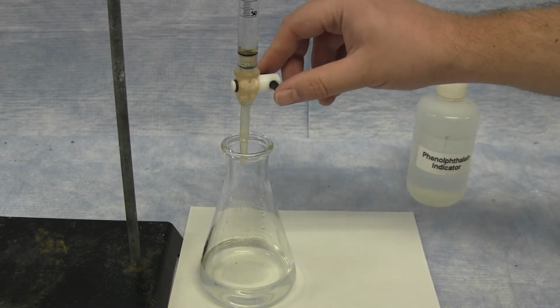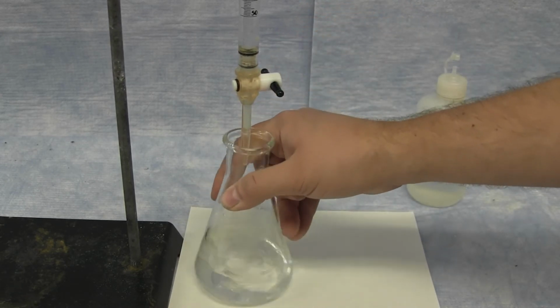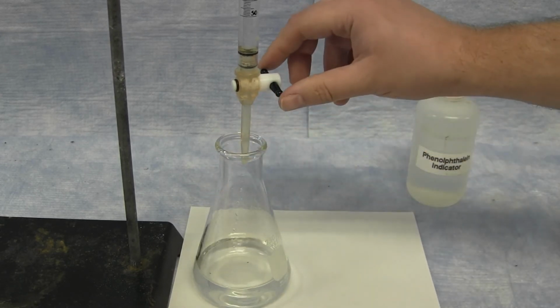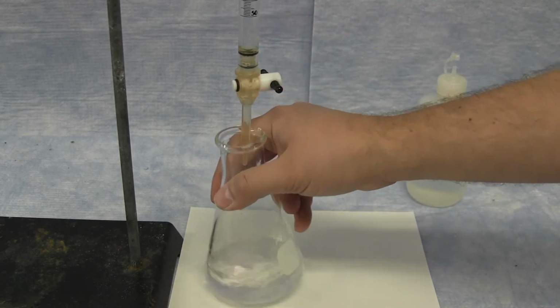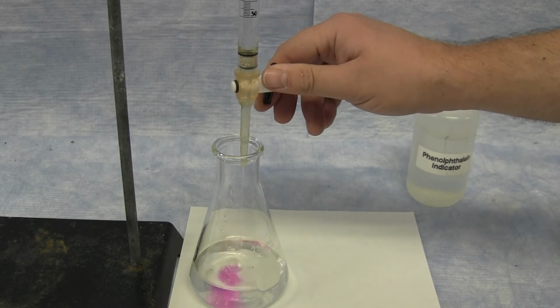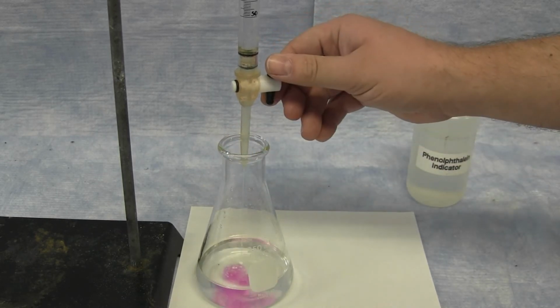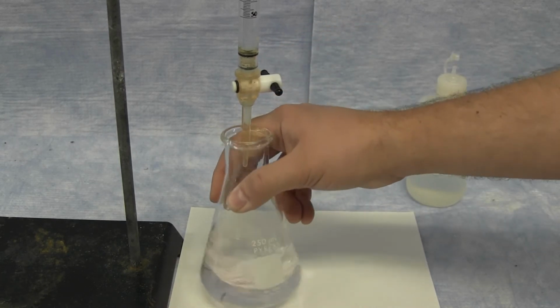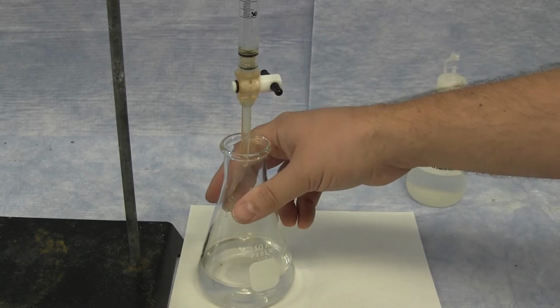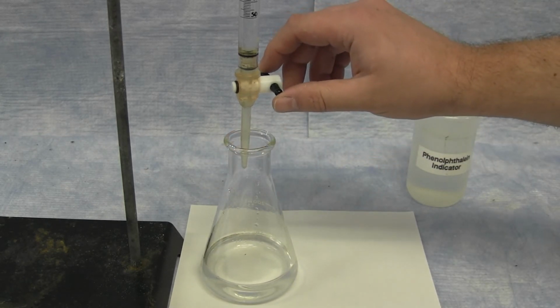Up, all of the acid is used up and reacted with the base, and you've reached the equivalence point where one additional drop of the sodium hydroxide solution will cause the pH of the flask to increase beyond the indicator's color change point.